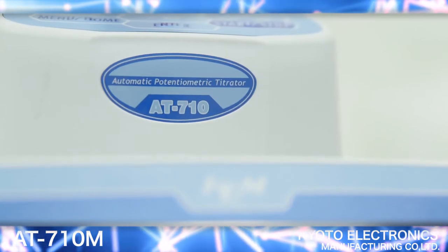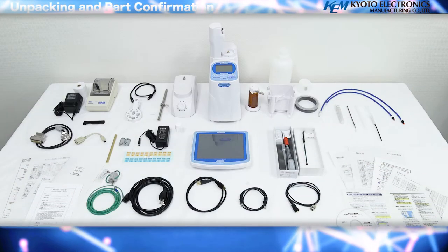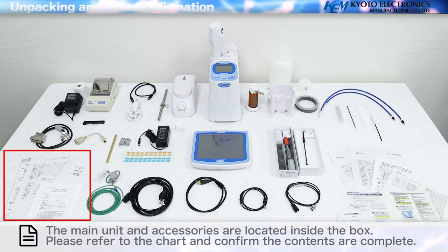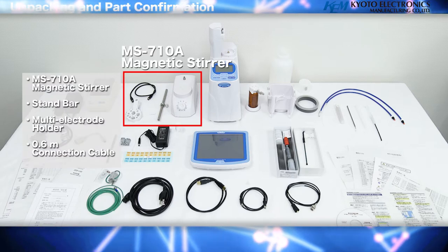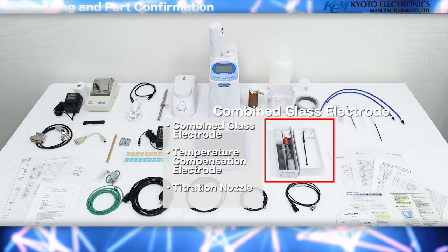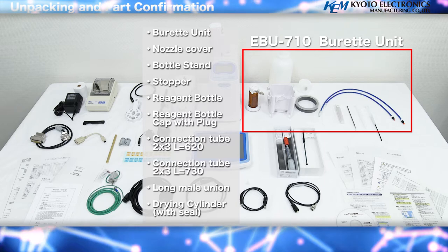An explanation regarding the use of the AT710M. Unpacking and parts confirmation: the main unit and accessories are located inside the box. Please refer to the chart and confirm the contents are complete. Included accessories are the MS-710A Magnetic Stirrer, Combined Glass Electrode, and EBU-710 Burette Unit.